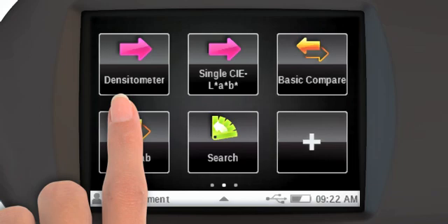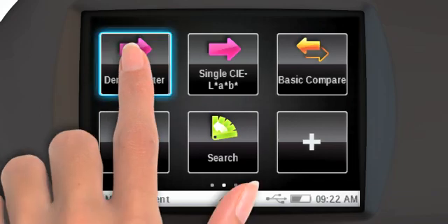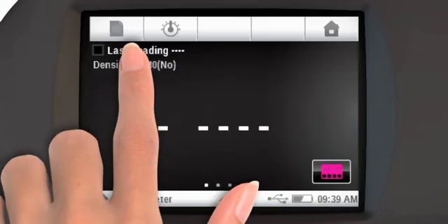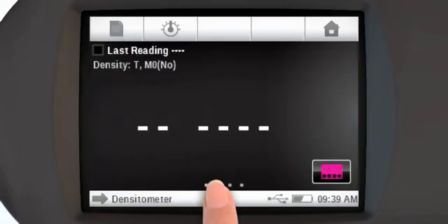Tools are selected with a tap. To configure a tool, tap on this arrow at the bottom of the screen.